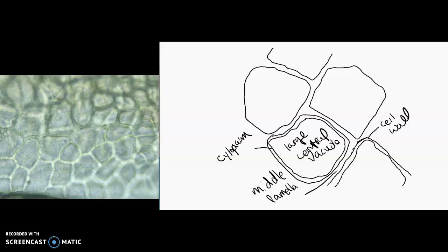You might also be able to see some nuclei in there.